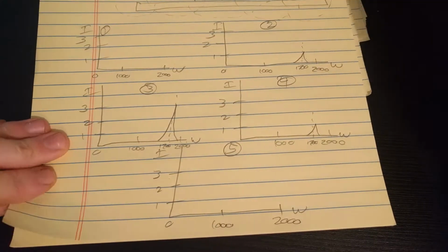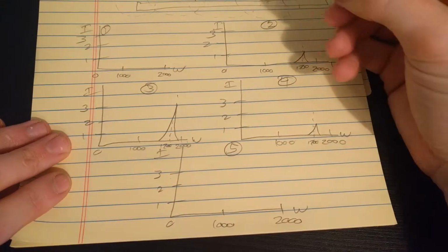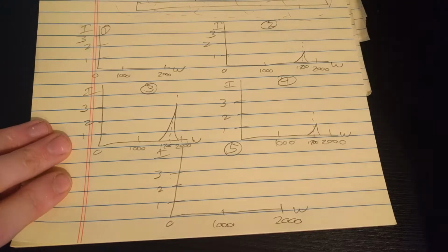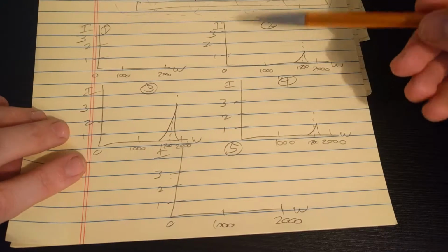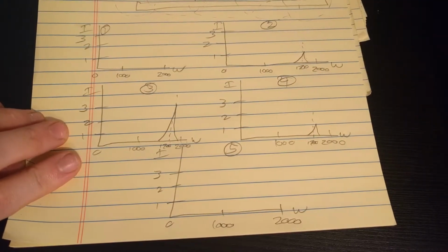So what we essentially just did was map out where is our molecule on the surface of the metal. And we found where most of it is. Most of it is in spot 3.